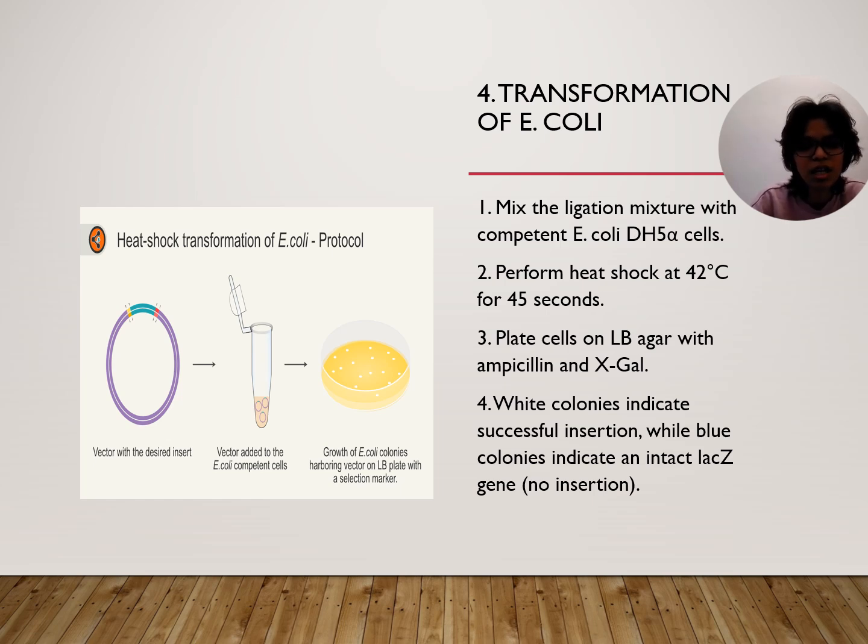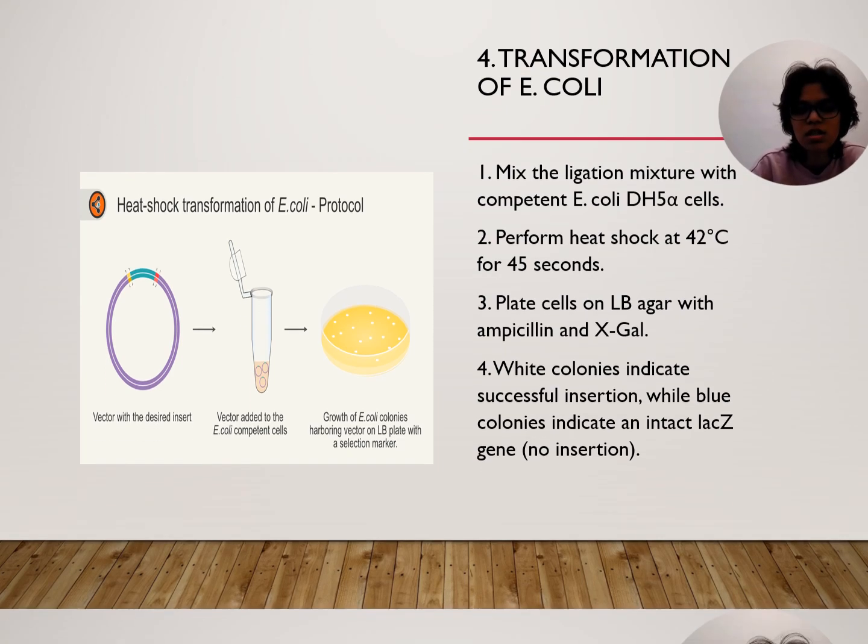This LB agar is a nutrient-rich growth medium used for culturing, especially growing bacteria, especially E. coli. Then we'll leave it for one or two nights. Then we can find some colonies formed. White colonies indicate successful insertion, while blue colonies are intact with the lacZ gene, no insertion.